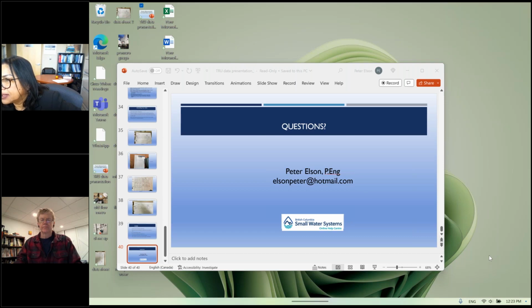This question is from Mark. Is the CT calculation for chlorine contact time to get the 4 log only done when a system is set up or changed? And is there an online calculator we can use where we just plug in the parameters to get the CT number?